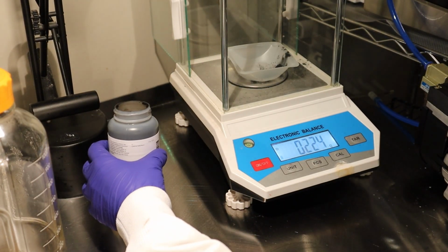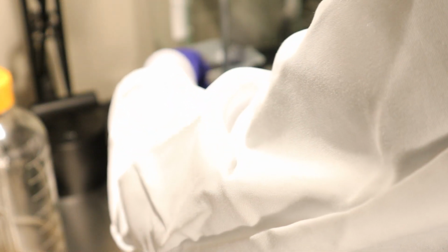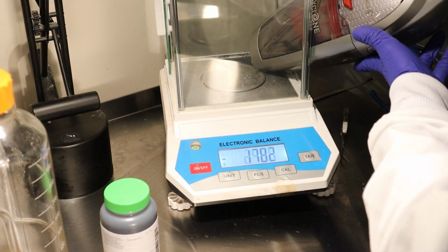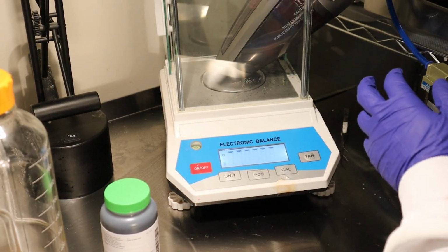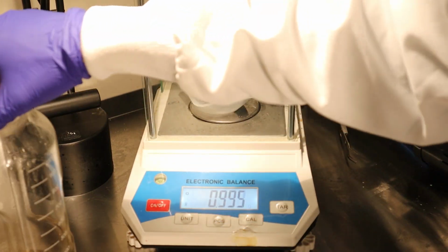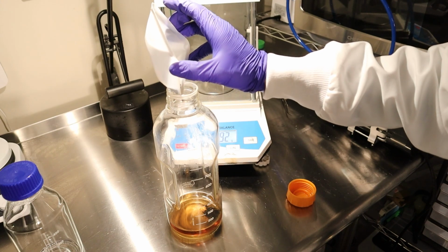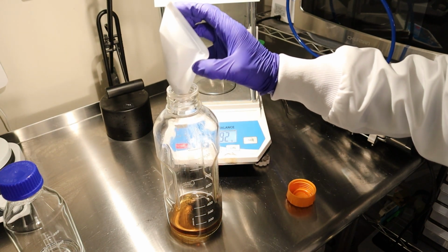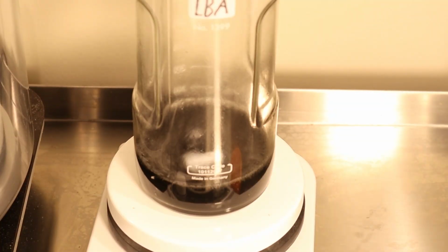I added 1 gram of activated charcoal and stirred it for around 30 minutes to perform something called a charcoal absorption.